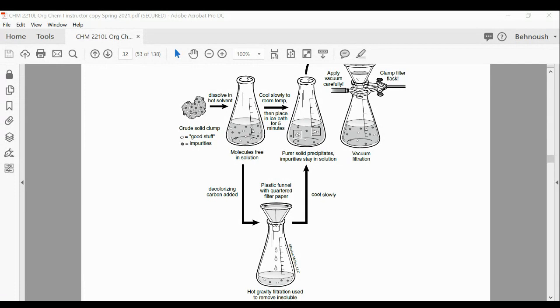You want all of the steps that are listed? 2 major steps. I'm going to give you an example. Like for distillation, we had 2 steps: evaporation and then condensation. What are the steps involved in recrystallization?